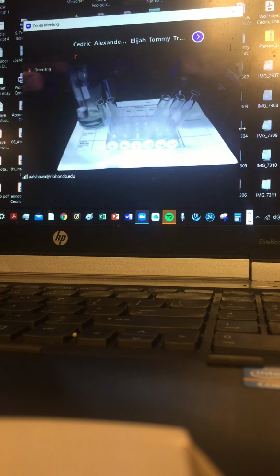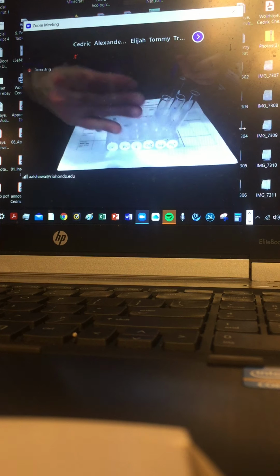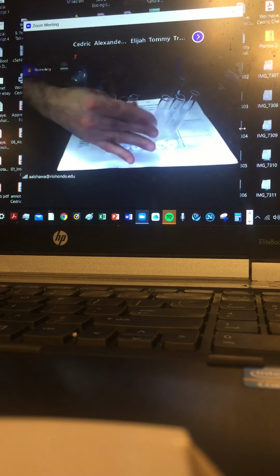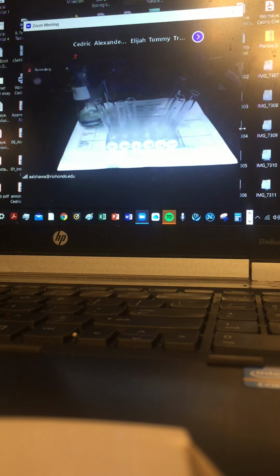Okay, so they all kind of produce the same background. So this is sort of the outcome of these halides. So the halides are negative to that barium chloride test. So let's see which one's going to turn out to be positive.